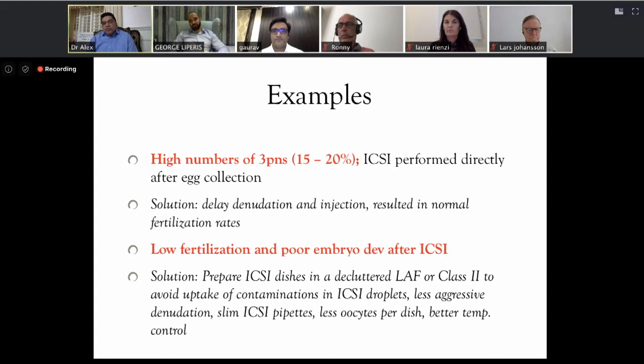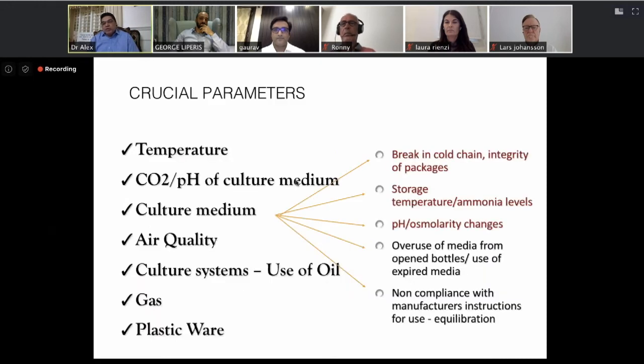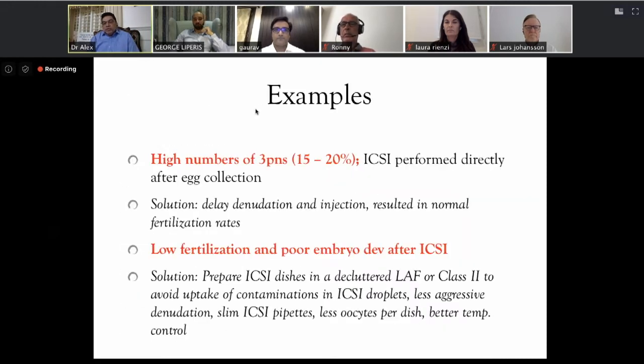Interestingly, the next day after 24 hours, we found only 30 or 40% survival in the test, that means in the tri-gas test incubator, but in the other it was around 70 to 80%. So we were thinking, what is the reason? We tried out all the options, temperature, everything was fine. Then we changed the CO2 connection, because all the incubators were connected via an inline filter with activated carbon, so that side had nothing to do with it. So we changed to a so-called medical grade gas in that tri-gas. Again we tried the same, a lot of experiments, but again we found the same thing.